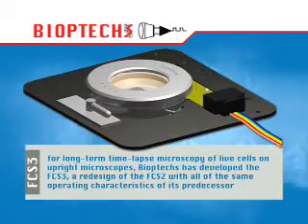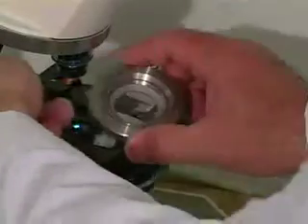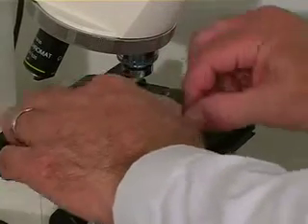For long-term time-lapse microscopy of live cells on upright microscopes, Bioptechs has developed the FCS3, a redesign of the FCS2 with all of the same operating characteristics of its predecessor.